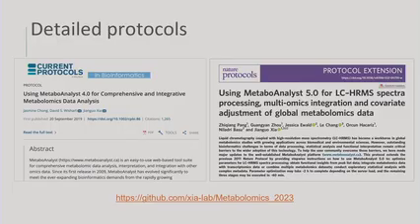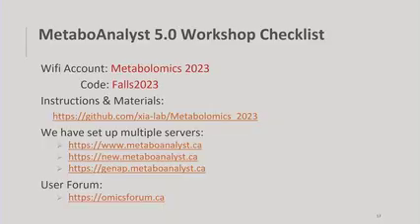And we do have these protocols. Four hours is clearly not enough, but we do have very detailed protocols. One we published last year in Nature Protocols, which really focuses on two sections today, raw data processing and multivariate analysis. For stats, we have another protocol published for version 4.0, which is still relevant. So more or less, you can follow them to do your analysis. Even if you miss something, you can download the paper and just follow it.